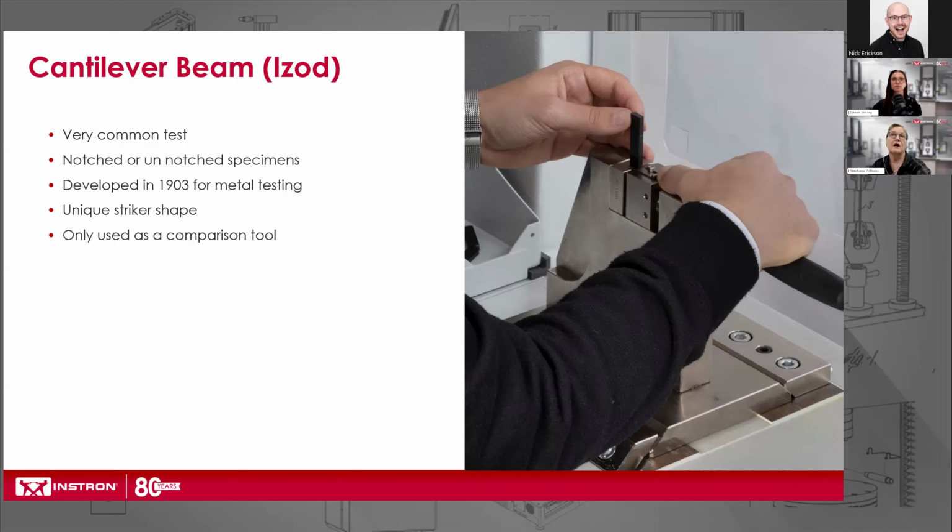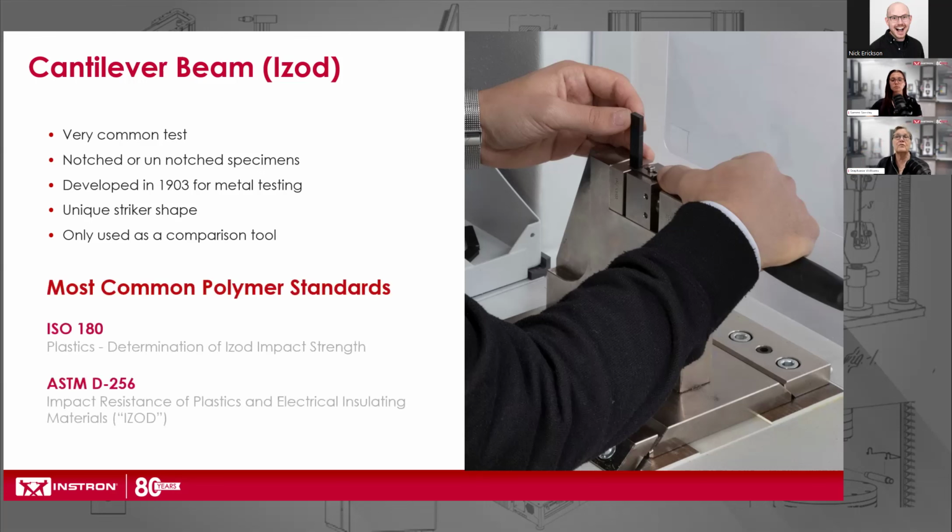Again, you would note the energy absorbed values as well as the specimen break type, and those break types would be the same as they were in Charpy: a non-break, a partial break, a hinge break, or a complete break. The most common standards are ISO 180 and ASTM D256.